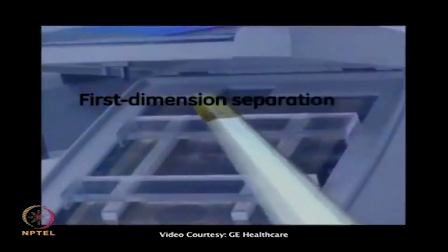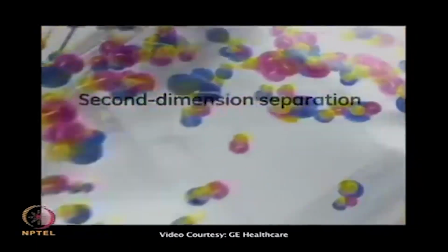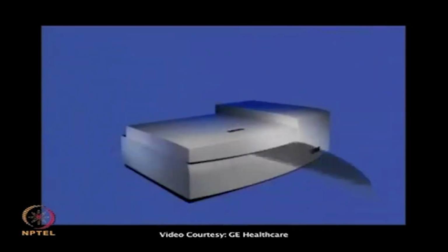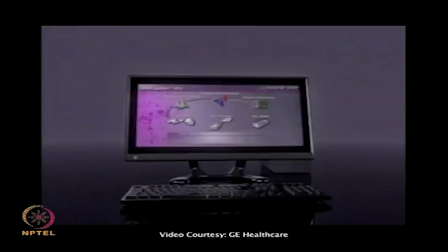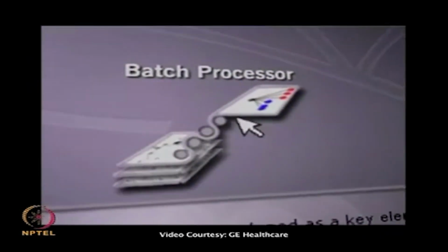There it will be analyzed in the first dimension, the IEF. After analyzing IEF, you place it into the second dimension, where it is completely analyzed. Now this gel can be scanned in the Typhoon Trio Plus, where you will have three images from a single gel. Then this can be analyzed with the help of DeCyder software, where the complete analysis can be done.